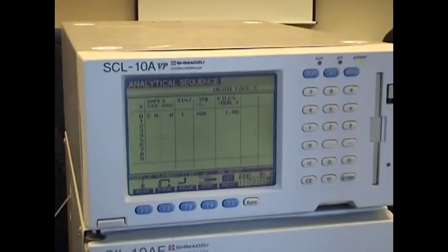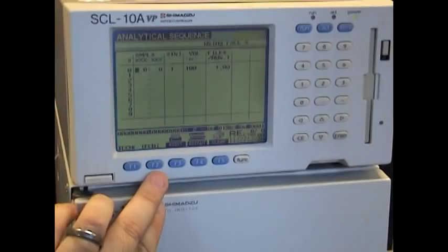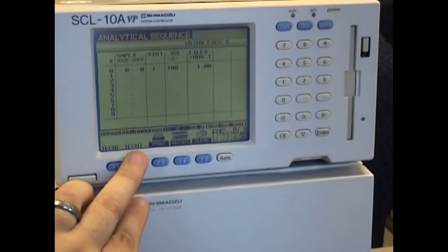Then these extra function keys down here will change depending on hitting function. You'll need to hit it once and twice. Notice F2 says TechEye. If you do not see anything there, you are not properly in service mode. Start again by holding F1 while powering on.